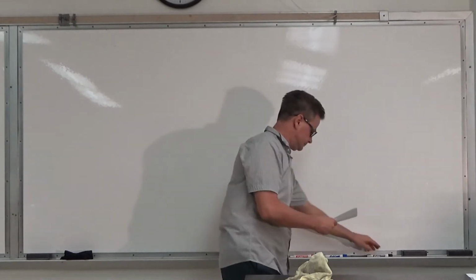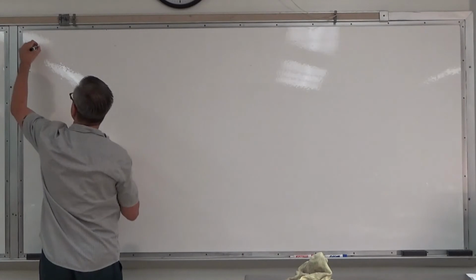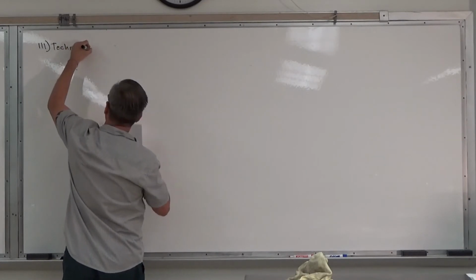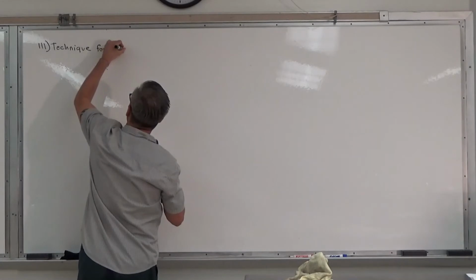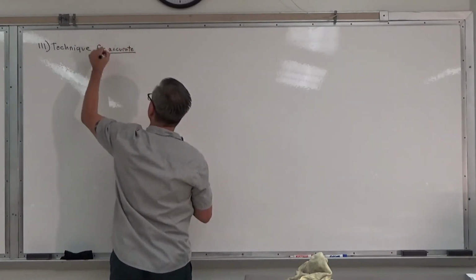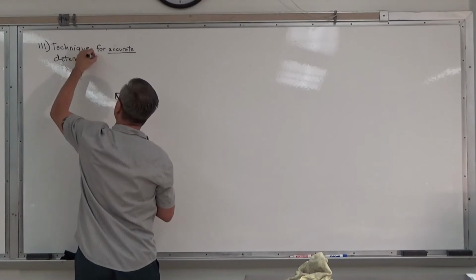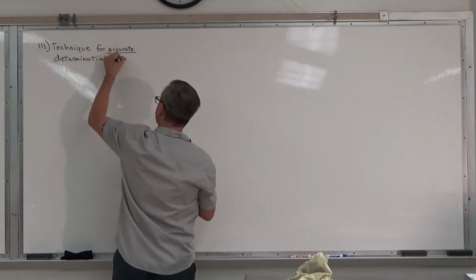So, a technique for accurate determination of freezing point is the key.